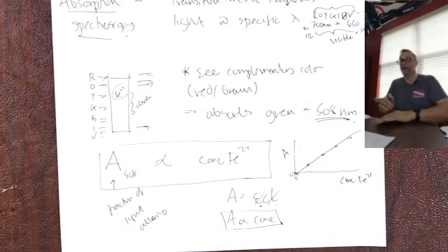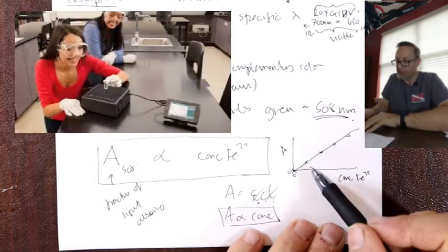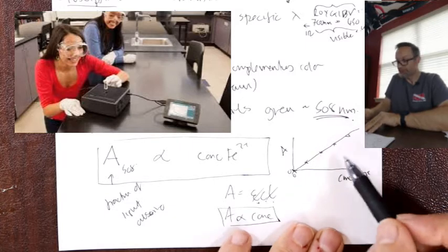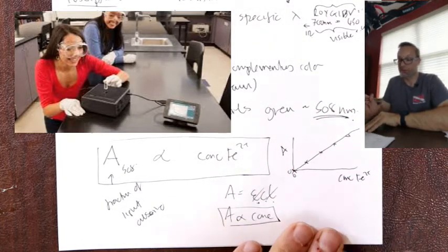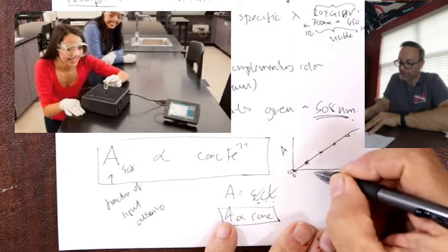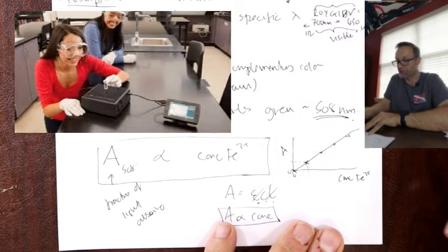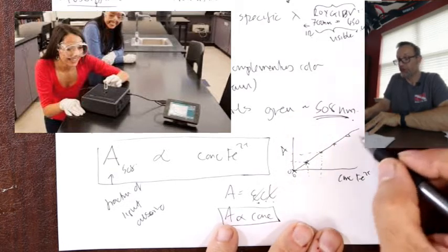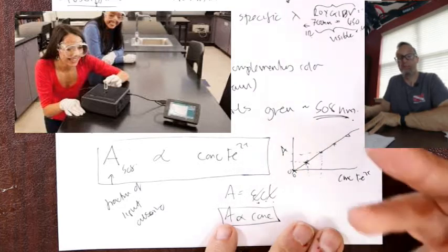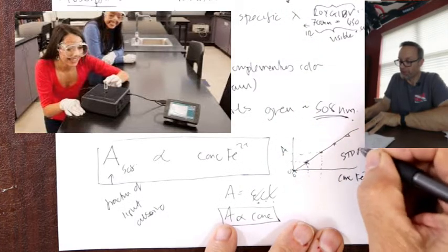All right. Now, in your lab, what you would do is you'd actually make these various solutions, okay, and you'd record their absorption for known concentrations. So you get these points on the graph, so you know the concentration because you made that solution, you recorded the absorption, and you get a straight line. Okay, now that works for every iron solution, yeah? Okay, so that's like your standard plot.